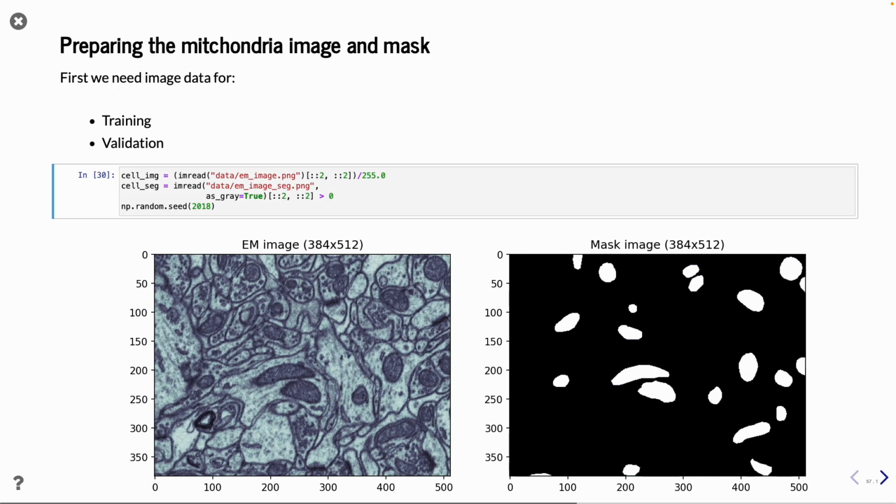So let's try. We have our data, which is, this is the input, and this is what it should be. This data set is available in the EPFL Computer Vision Group database. So I think it was 160 of those slices as training and test data. So there is quite a lot of data in that data set.